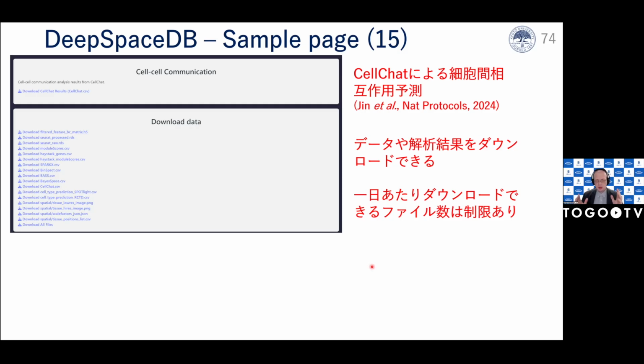if you are using Visium, actually Visium data is not so big. The number of spots is typically 2,000 to 4,000 at most. So compared to the single cell data, it's quite small. And I think I can analyze it on just a normal laptop, actually. I can analyze it just on my normal desktop PC, which is not such a good PC, actually.